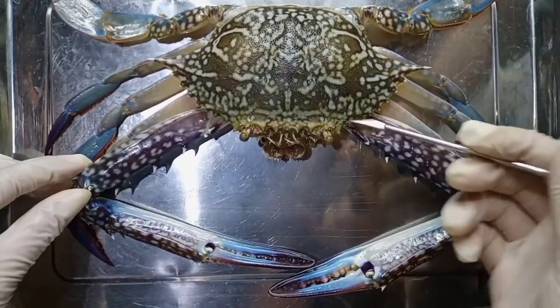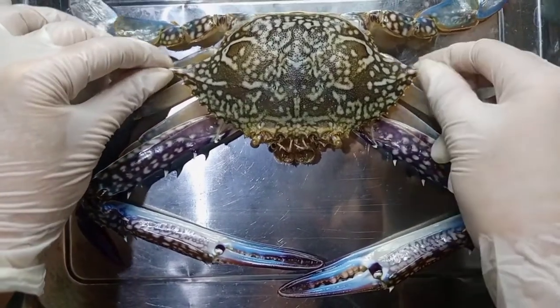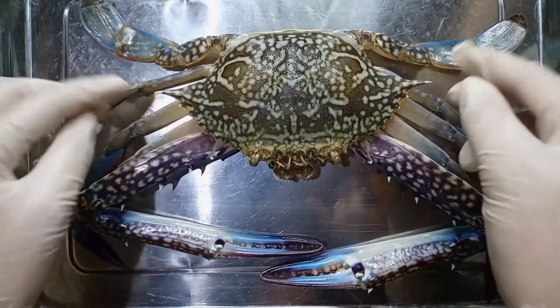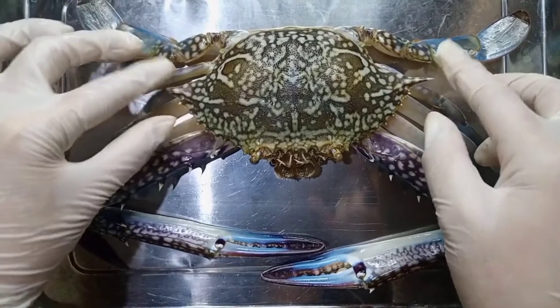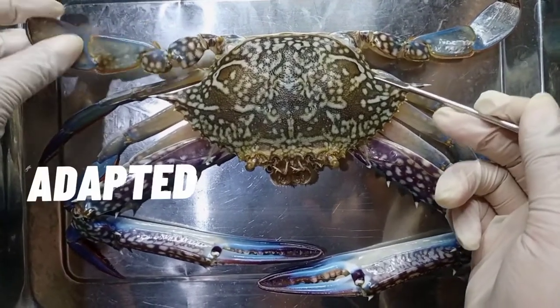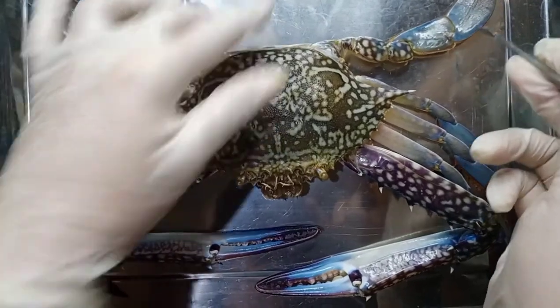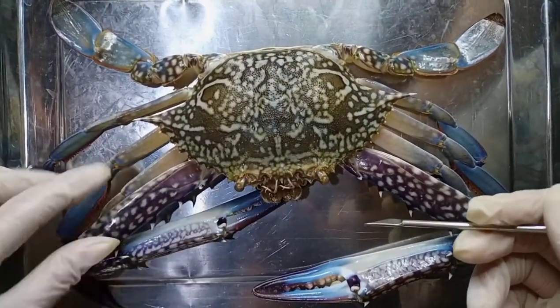Second, the anterolateral spine must be well developed or spread at greatest width, and has the same length and width. Here are the anterolateral spines — I measured it earlier: its width is 15 cm whereas its length is 7 cm. Lastly, the last pair of pereopods or legs must be adapted for swimming. As we can see, it has paddle-shaped legs, which basically help the crab to swim.